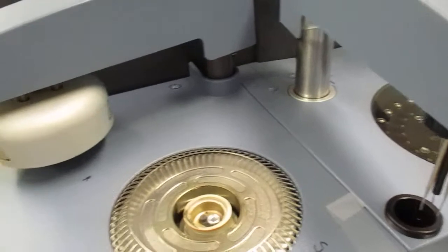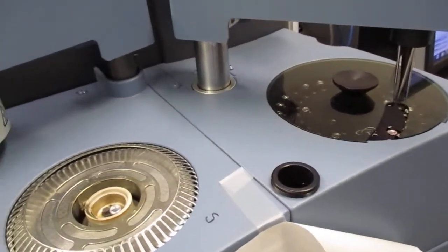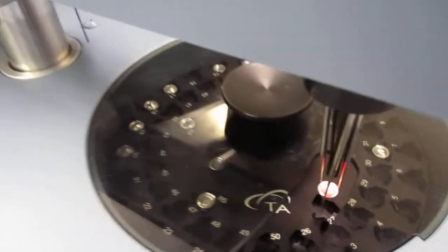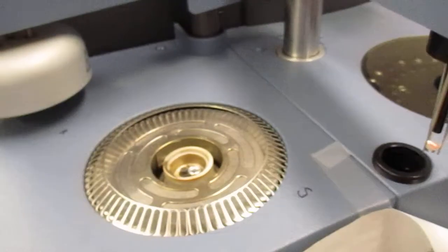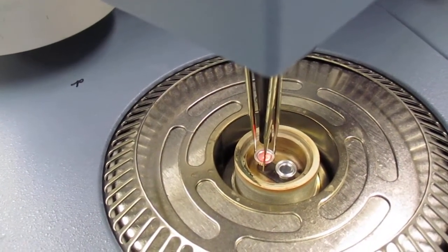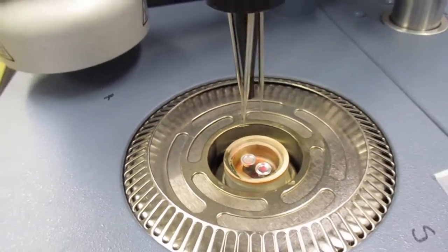Once it's done with this and it closes that lid back on, it'll start that data collection on that graph that I had previously shown. So now it's grabbing the reference pan and lid. And now you can see they're both in there very neatly.